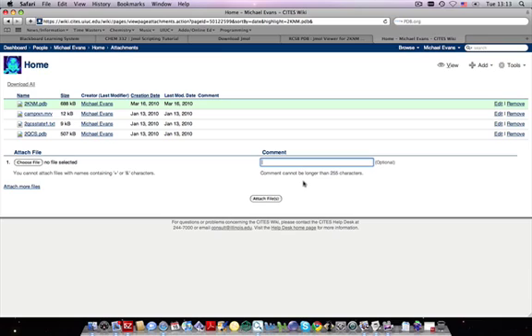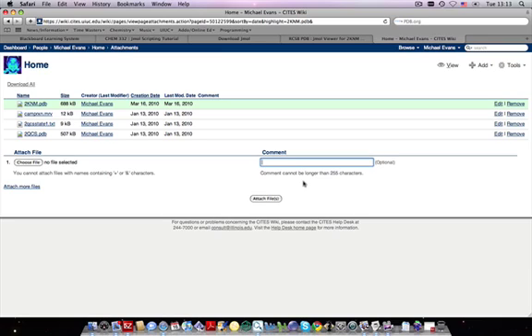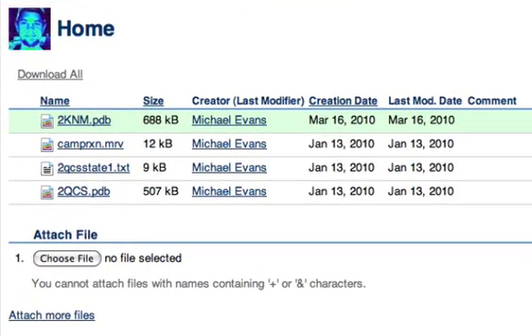Once it's uploaded, you need to open the file from the internet in your local copy of JMOL. This is done by first getting the URL of the attached file and then opening a URL in JMOL.